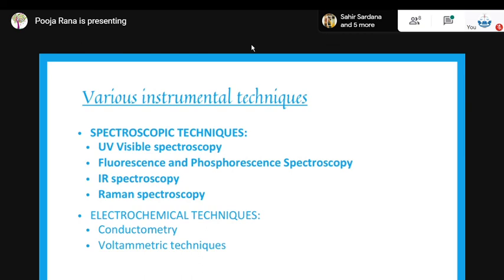Because of that vibration, some waves are created, and these waves are detected, and each molecule has its own tendency of sending out information about its composition through vibrational energy. All right. So that is the basis of infrared spectroscopy.